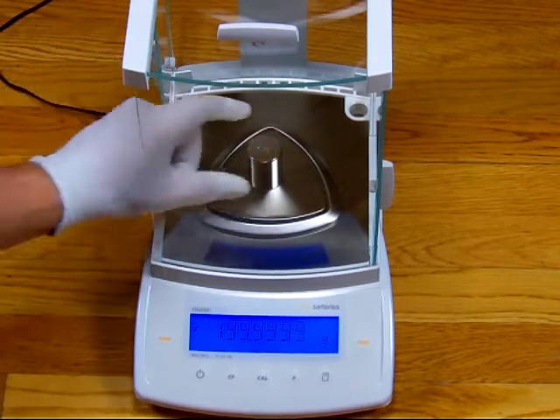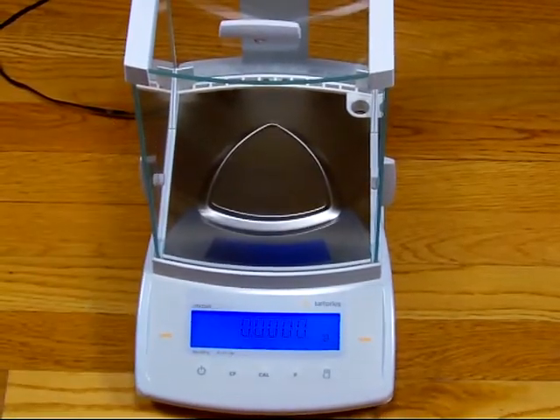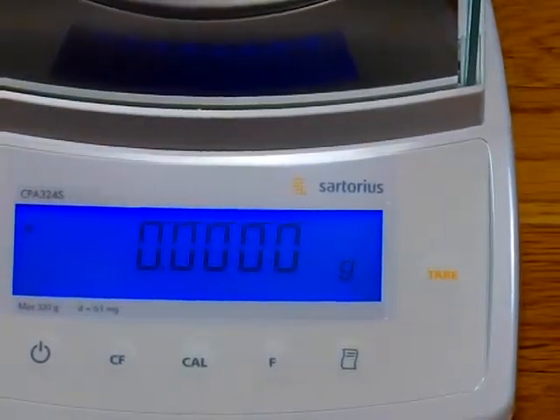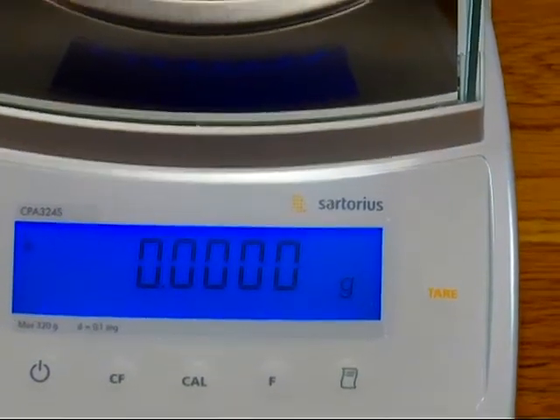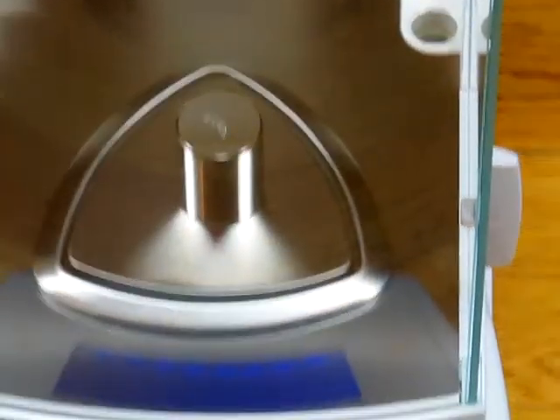We'll see how the repeatability is — we'll take the weight off. Notice how fast the balance is; it returns right back to zero. Competitive brands out there, the balance is extremely slow. There is no comparison.